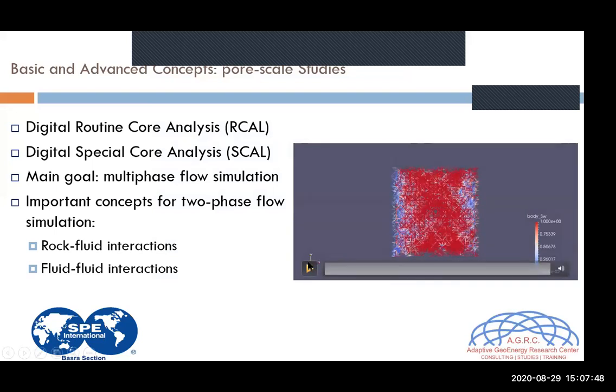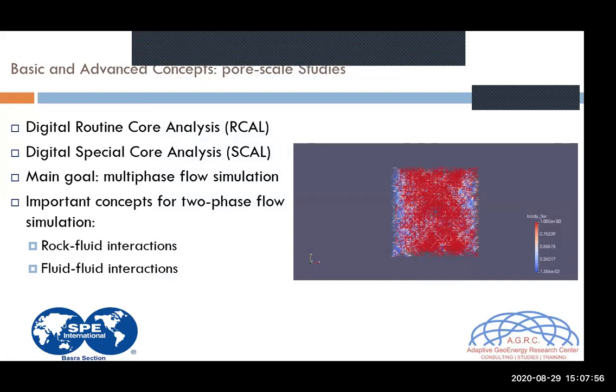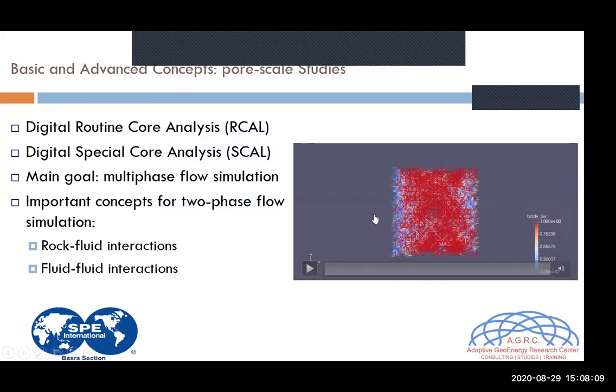What I want to show you here is a two-phase flow simulation, a PNM-based numerical simulation, covering, for example, two fluids inside a pore system. This one here is a regular one, and you can see that we have it filled with the red fluid, and now you are invading with the blue fluid.